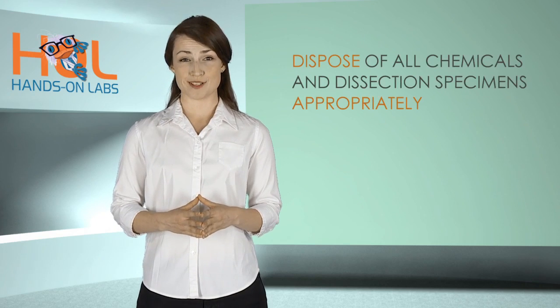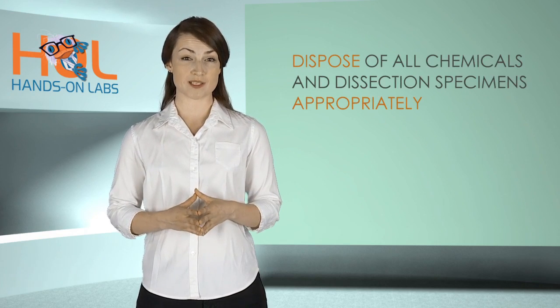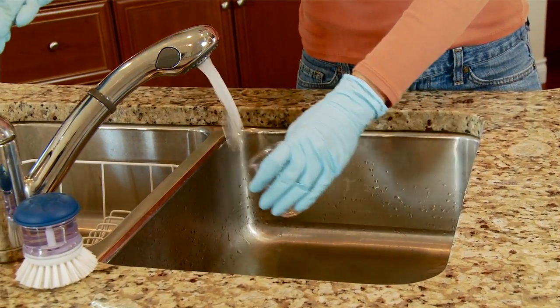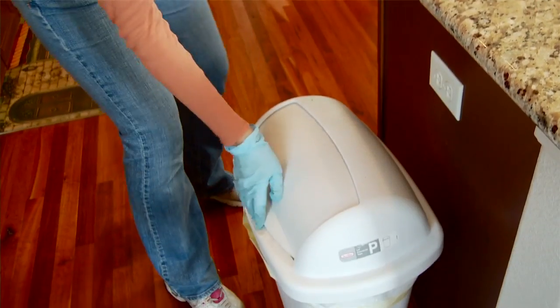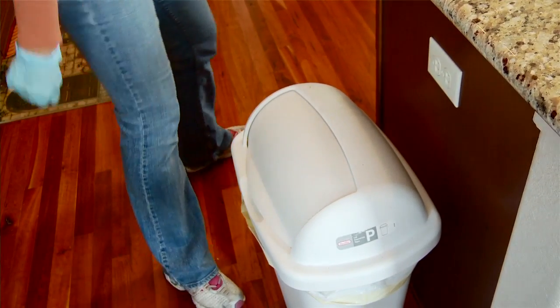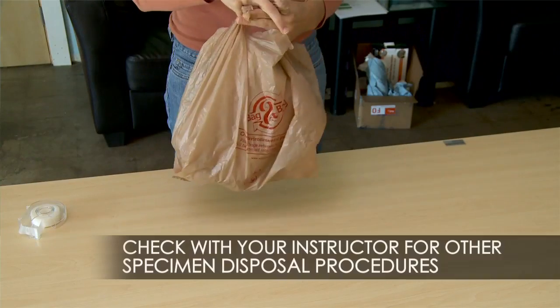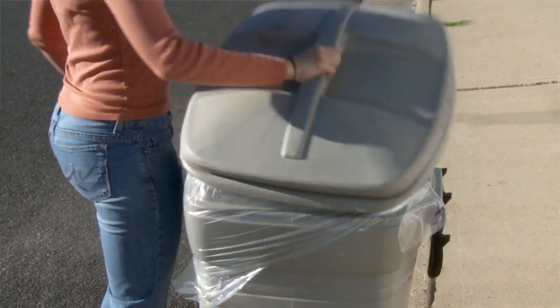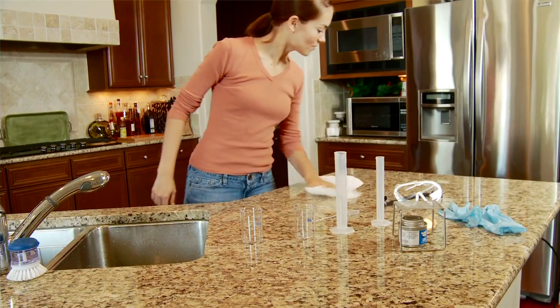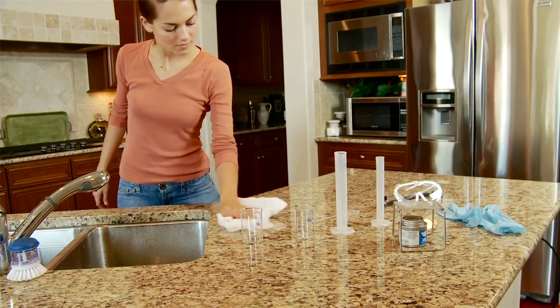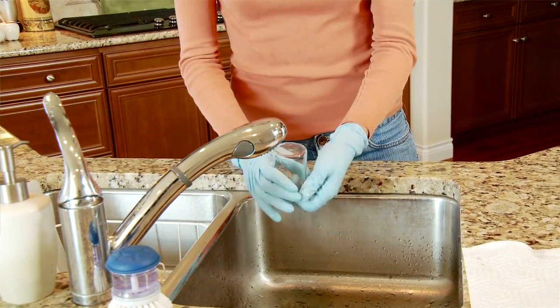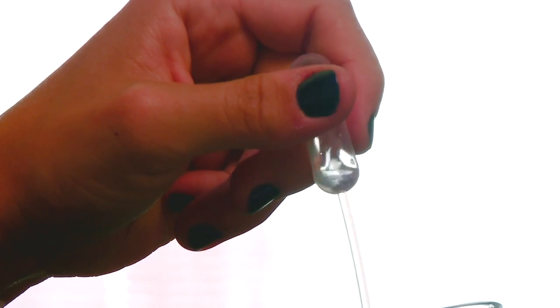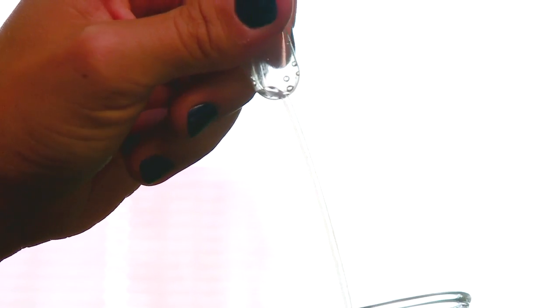During cleanup, dispose of all chemicals and dissection specimens appropriately. Used and unwanted microscale chemicals can be flushed down the toilet or sink and non-chemical items can be disposed of in the trash. Wrap dissection specimens in newspaper and seal in plastic prior to placing in the trash. Wash your work surface and all laboratory equipment with dish detergent and warm water. Rinse equipment with distilled water and air dry glass objects.